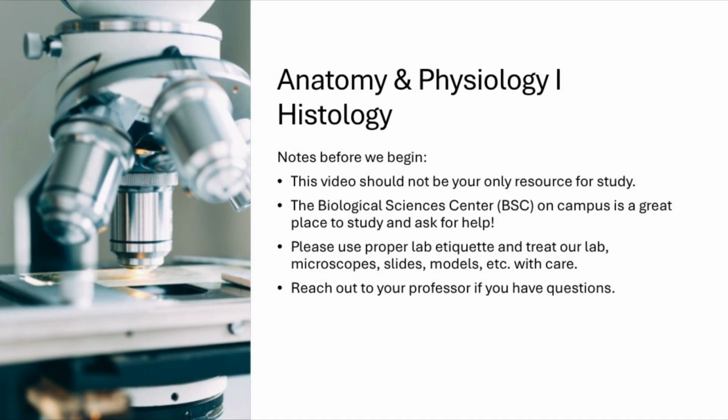And while you're there, please use proper lab etiquette and treat our lab microscopes, slides, models, etc. with care. You can also request oil for oil immersion to see things closer up, but that is upon request just to make sure we're not damaging our microscopes or our slides.